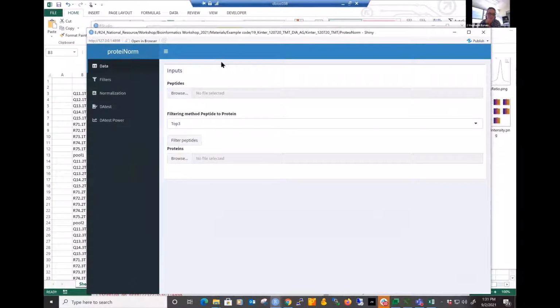Yeah. Whatever. Will you talk about the importance of database matching too? Like how to create the database a little bit more and go into that, and using the CRAP file versus not using the CRAP file? Yeah, I wasn't planning on it, but we can talk about that a little bit. Yeah, database is always a fun challenge.